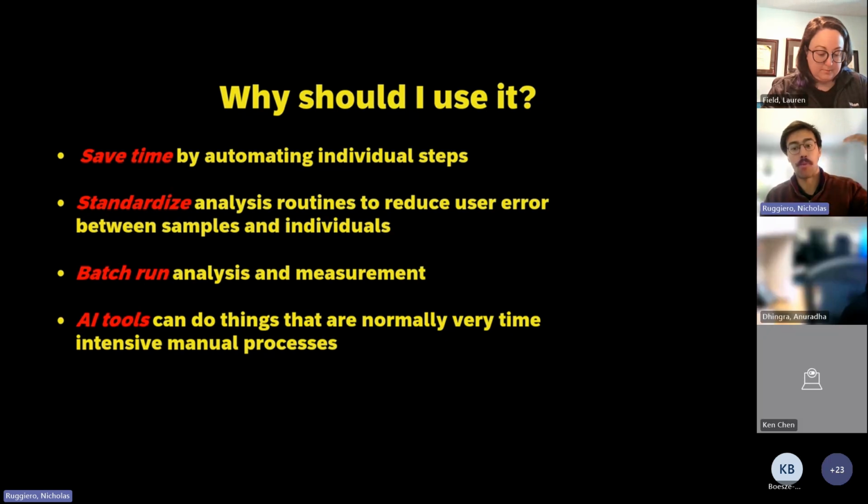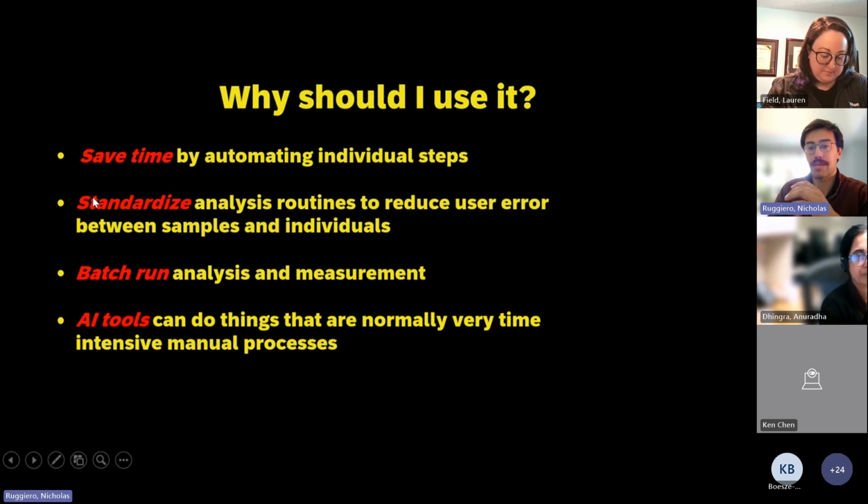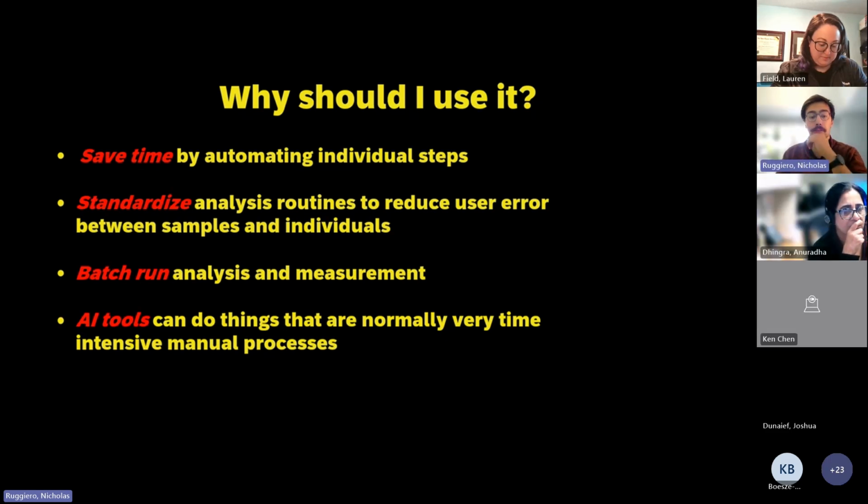And I can tell you that in the morning when I started doing these measurements, I was way more accurate than I was at like 5 o'clock when I was just trying to finish and get out of there. So cutting out some of that error, the variability in error, can be really useful. There won't be zero error in these images, but it will be constant and repeatable, which can be really useful when we're trying to measure some of the data that we're looking at.